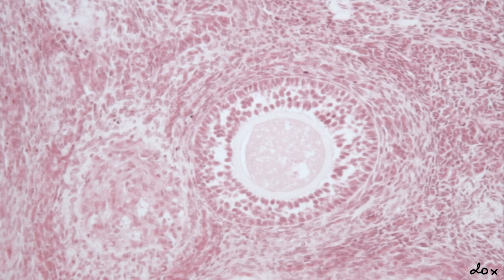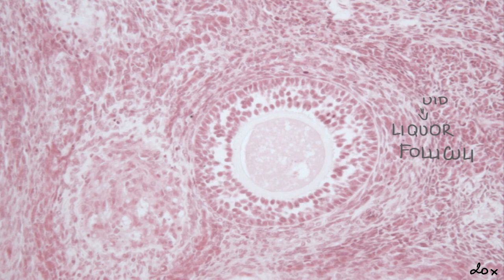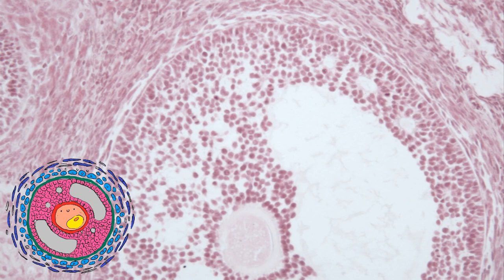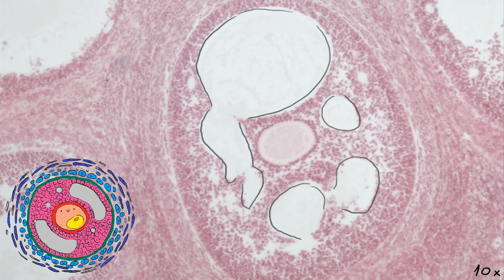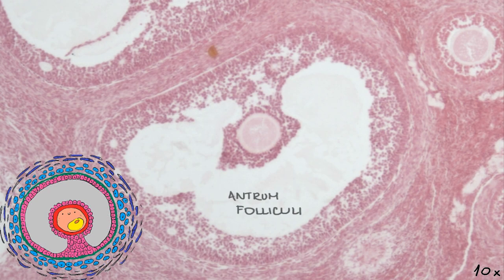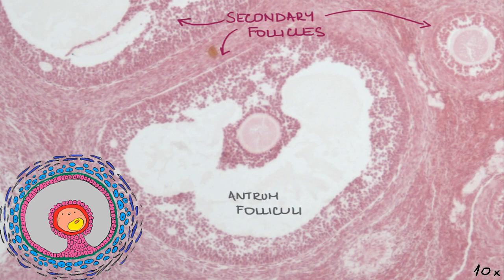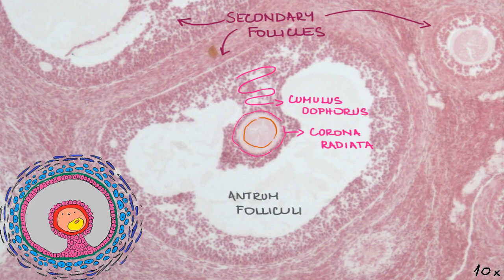Liquid moves out of the blood vessels and accumulates between follicular cells, which secrete their products into it. This liquid is called follicular fluid, or liquor folliculi. It is located within small cavities, which then gradually coalesce and in the end form one big cavity called the antrum. Follicles with cavities between granulosa cells are called antral or secondary follicles. Follicular cells immediately around and linked to the oocyte make up the corona radiata, and other cells further from the oocyte form a small hillock — the cumulus oophorus — surrounding the oocyte and protruding into the antrum, while fixing it to the wall of the follicle.